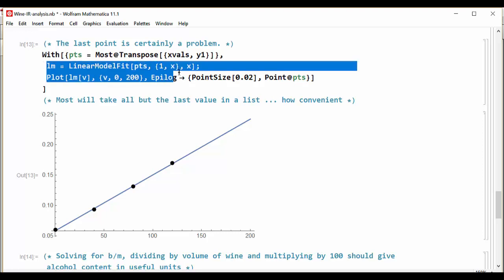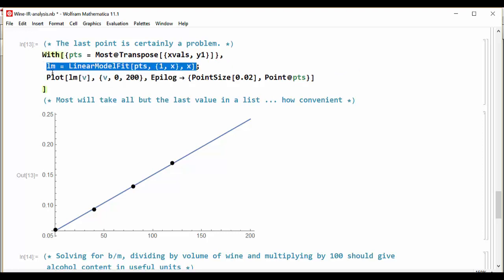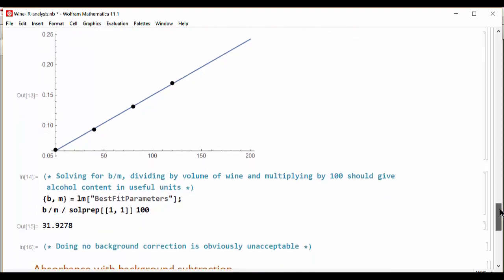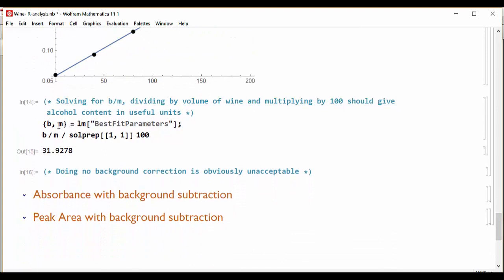And sure enough, when we create the linear model this time, I am going to save the linear model as a symbol for later use and plot it. We see that we get a fairly nice curve that fits the linear expression. And from that we can extract the slope and the intercept, and we know that the slope and the intercept are going to give us the x-intercept, which we can then divide by the volume of the wine that was used in our sample and then multiply by 100 to get a percent. And sure enough, we get around 32 percent for the alcohol content in this wine, which is absolutely completely and utterly wrong.